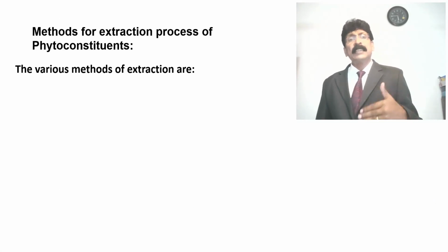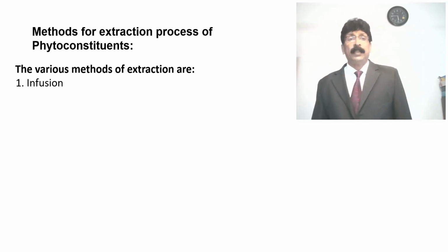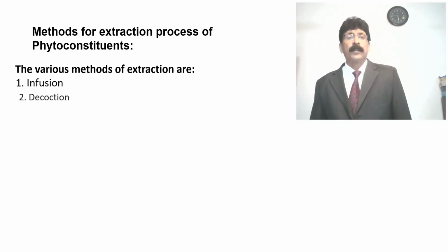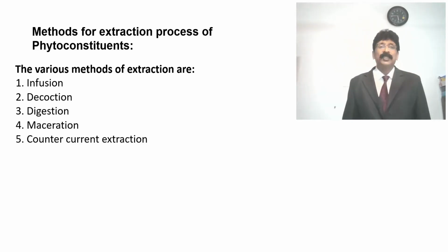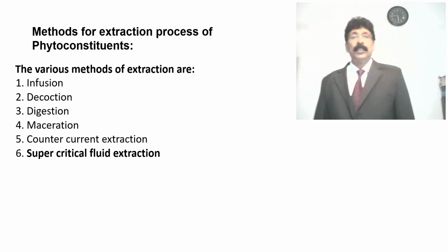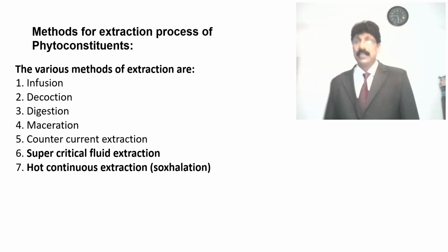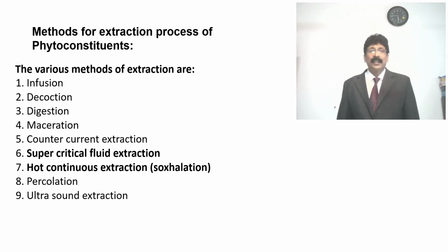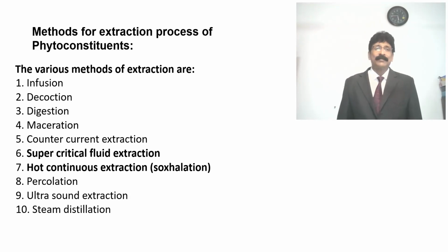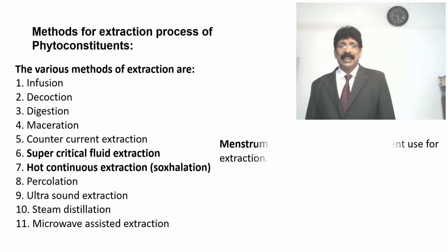Methods of extraction for phytoconstituents: various methods are there, starting from infusion, decoction, digestion, maceration, countercurrent extraction, supercritical extraction, hot continuous extraction, Soxhlet apparatus or Soxhlation, percolation, ultrasound extraction, steam distillation, microwave assisted extraction.